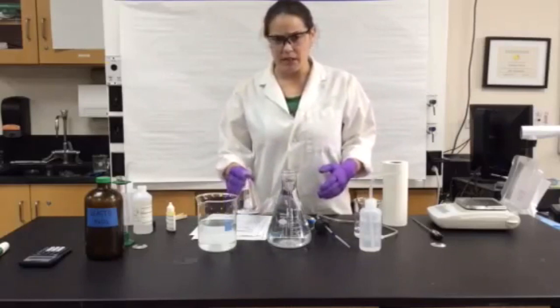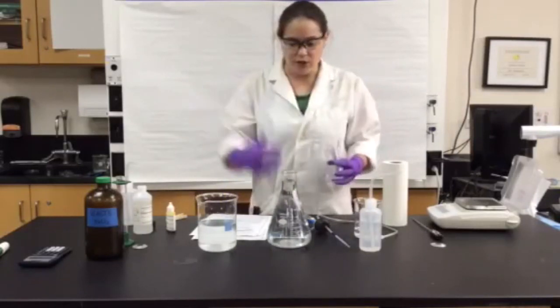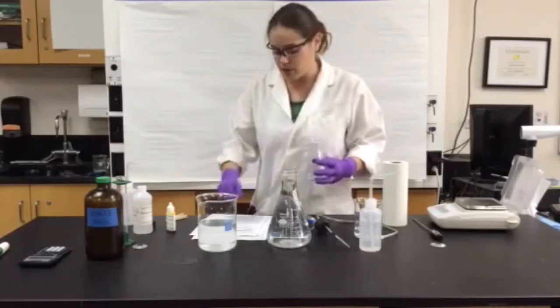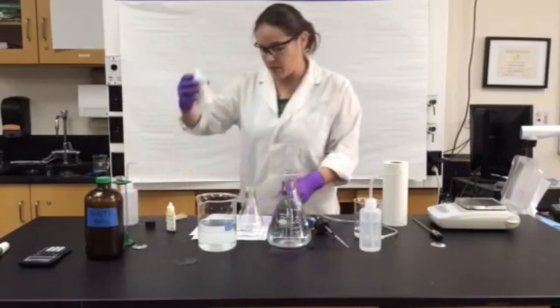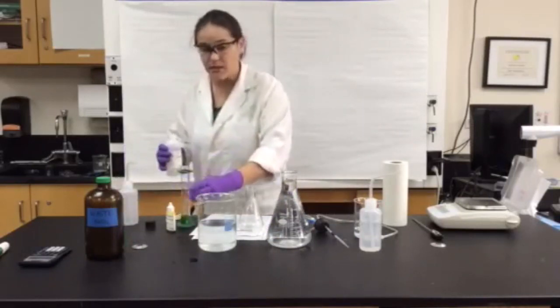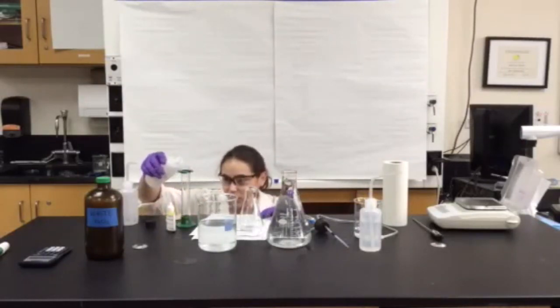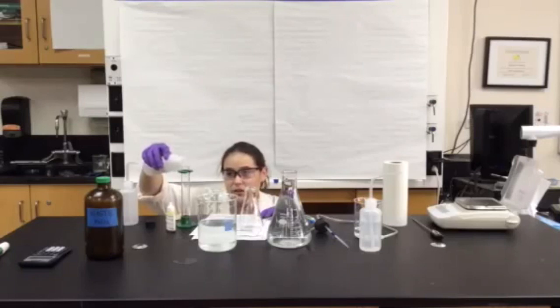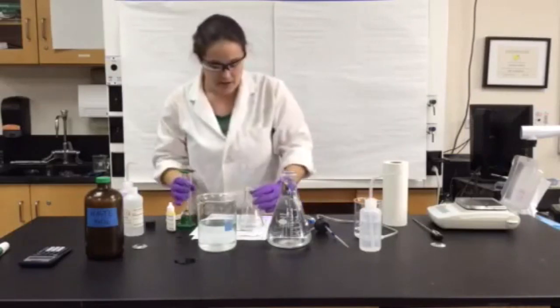The procedure can be a little physically tricky. When you first start getting started, have one of your group members prepare the reaction itself. Here I have some 3% hydrogen peroxide. We're going to measure about 15 milliliters of it. Make sure that your eye is level with your markings on the graduated cylinder. Measure about 15 — I got 16 that time but that's okay.